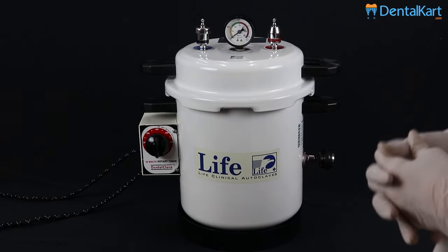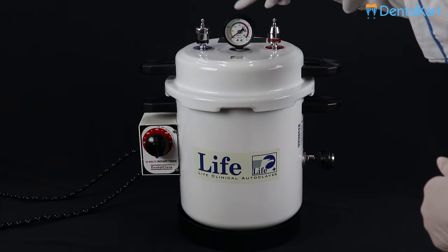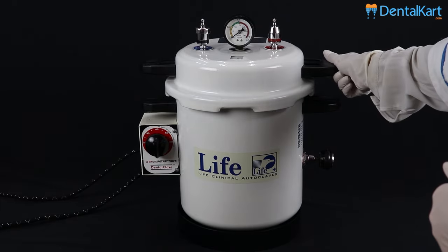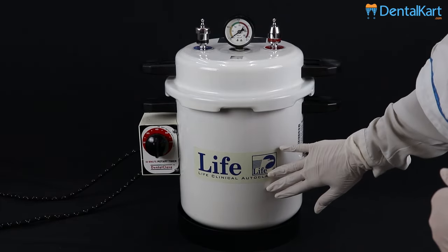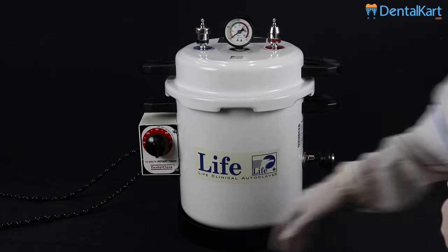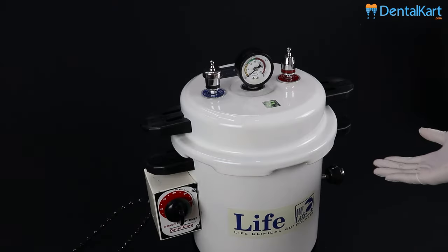The parts of a top loading autoclave are: safety valve, pressure gauge, pressure regulating device, lid, lid handle, body of autoclave, body handle, steam releasing valve, rotary timer, and black steel stand.